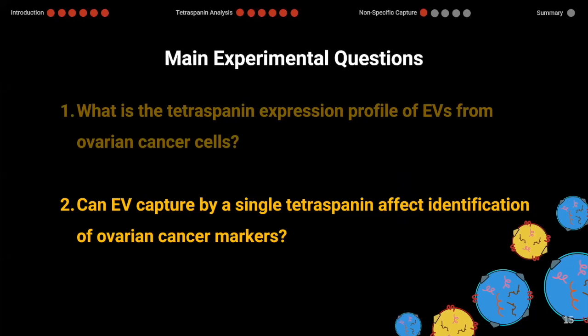So now that we had seen these subpopulations, was this subpopulation expression of clinical relevance? So far, we had been using the same sort of capture methods as many of these diagnostic tools, using single EV capture and comparing the three of them. However, to answer this question, we needed a way to non-specifically capture our EVs and get an idea of the entire population. Currently, there's no really well-accepted universal marker of all EVs. I know that there's a lot of work in this. Syntenin-1 is sort of a rising candidate.